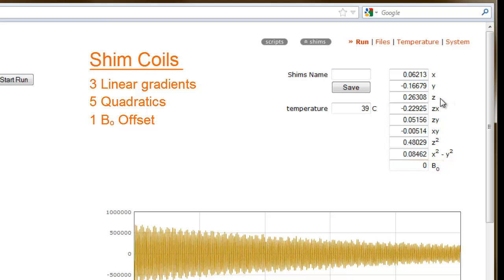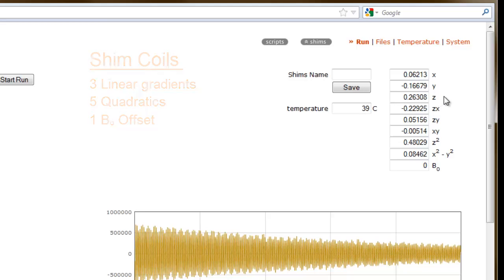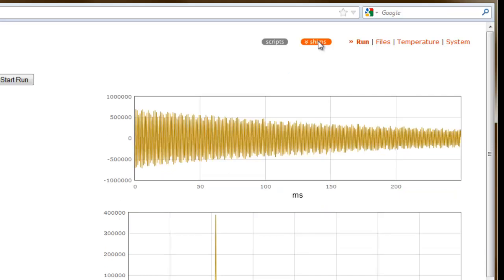The currents which are applied to these coils correct for inhomogeneities present in the applied magnetic field, and inhomogeneities introduced by the cartridge. Let's hide the shim values user interface for the time being. We'll come back to this user interface later, after we've shimmed our instrument and want to save our optimized shim values to a named file.